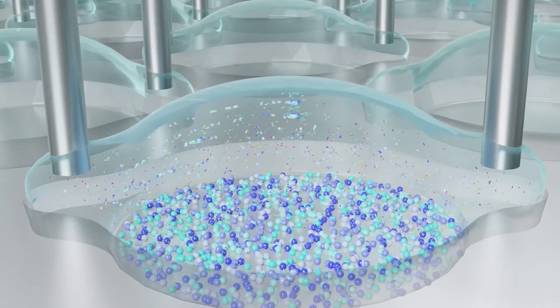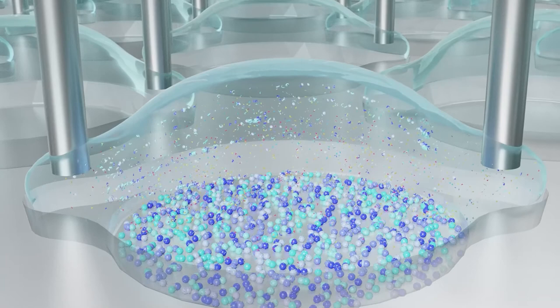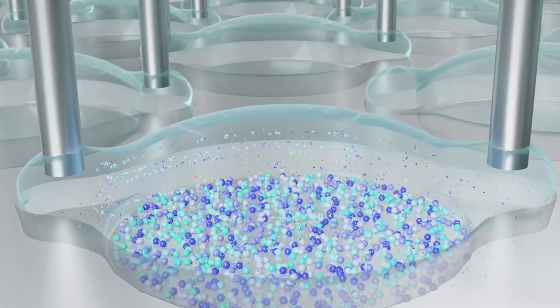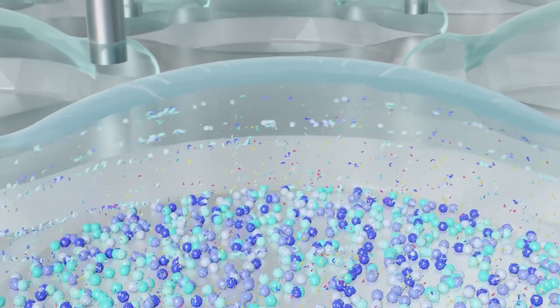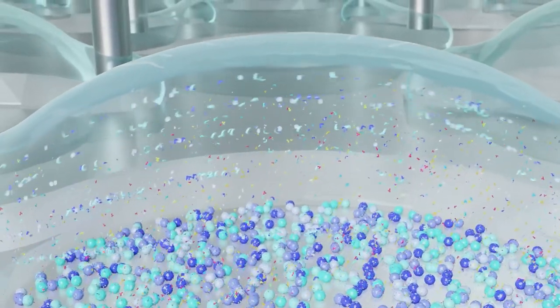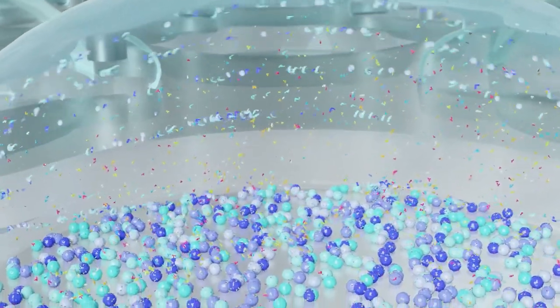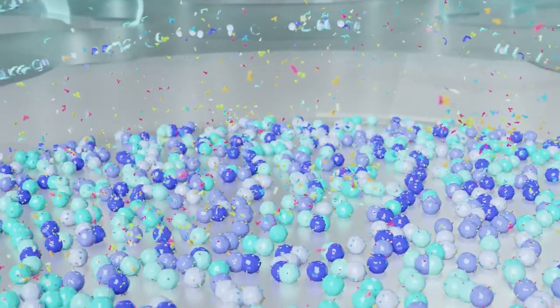The nozzles initiate laminar flow by precisely dispensing and aspirating buffer at the opposing satellite areas of each well. The low wall, in combination with low flow rate, creates laminar flow with the greatest velocity at the top, while rates are near static at the bottom, where the cells of interest are located.